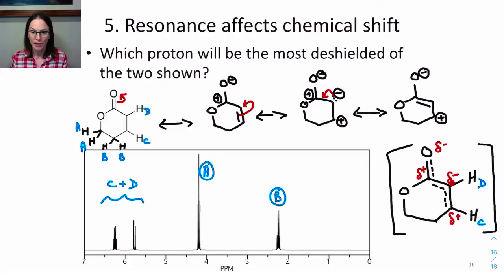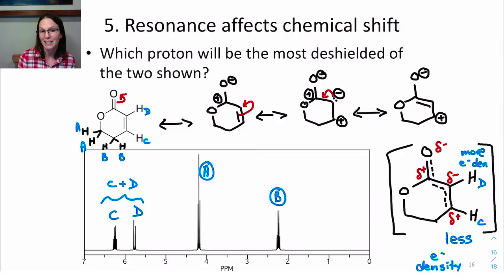Conversely, there's a partial negative on the carbon bound to proton D. So that means higher electron density or more shielded for that proton. So proton D gave rise to the signal around 5.8, more shielded. And proton C gave rise to the signal at 6.3, more deshielded, or less electron density.